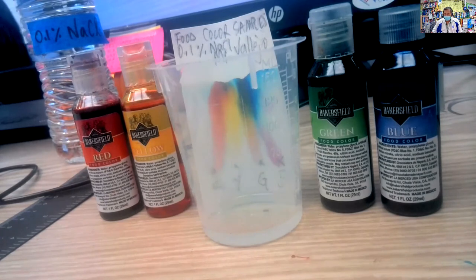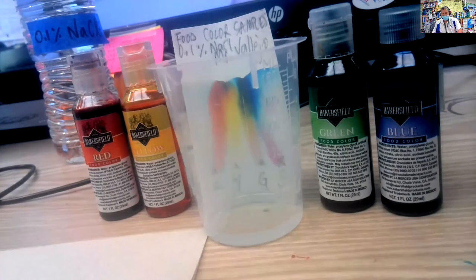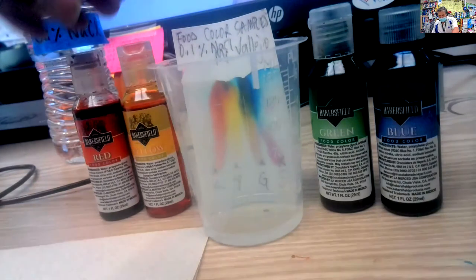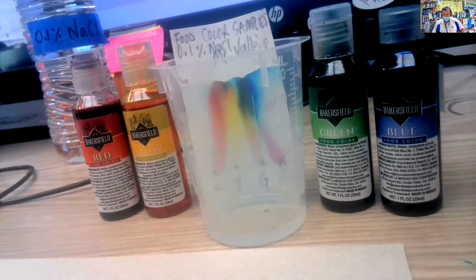All right, you guys, I'm going to go ahead and take the chromatography paper out of the chamber. And I put this on a paper towel right here. I also have next to the beakers the four different dyes so that you can see the labels. And so the labels tell you actually what colors, what dyes, what artificial colors are in each of these.